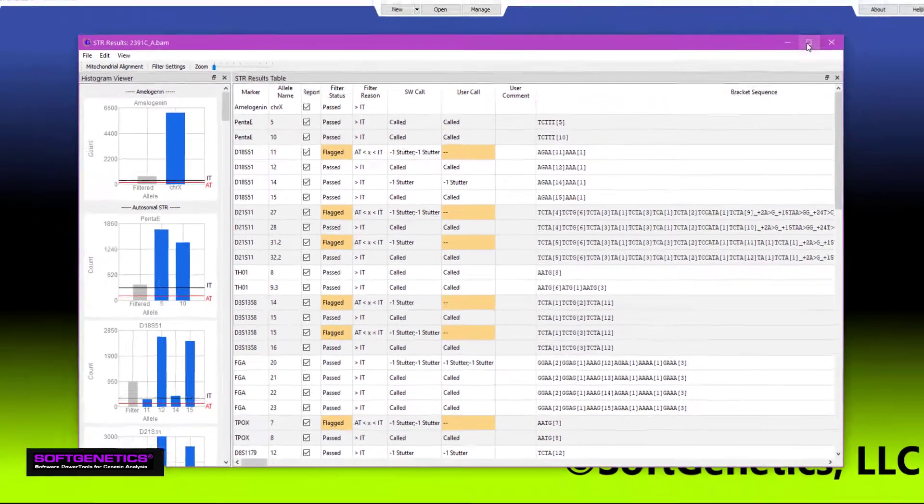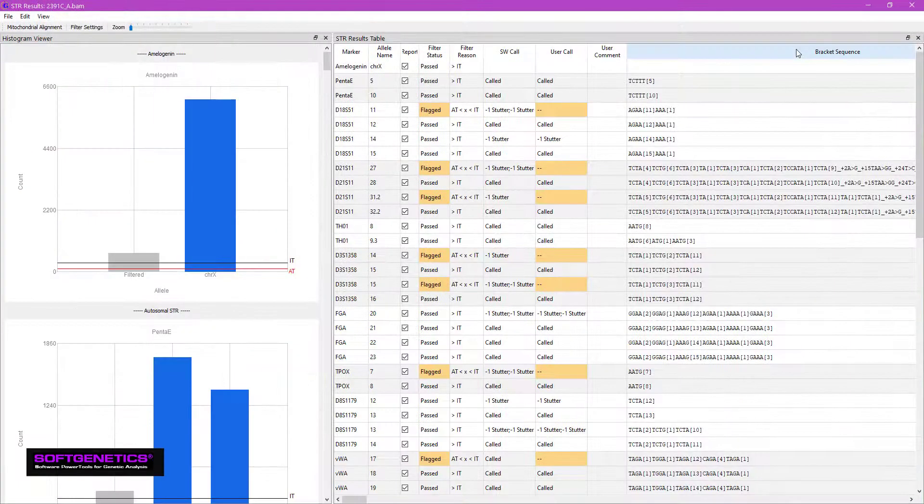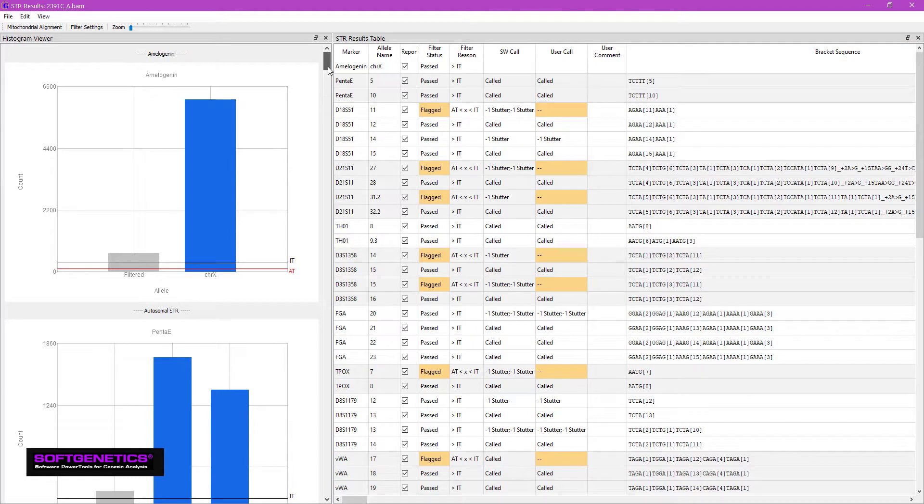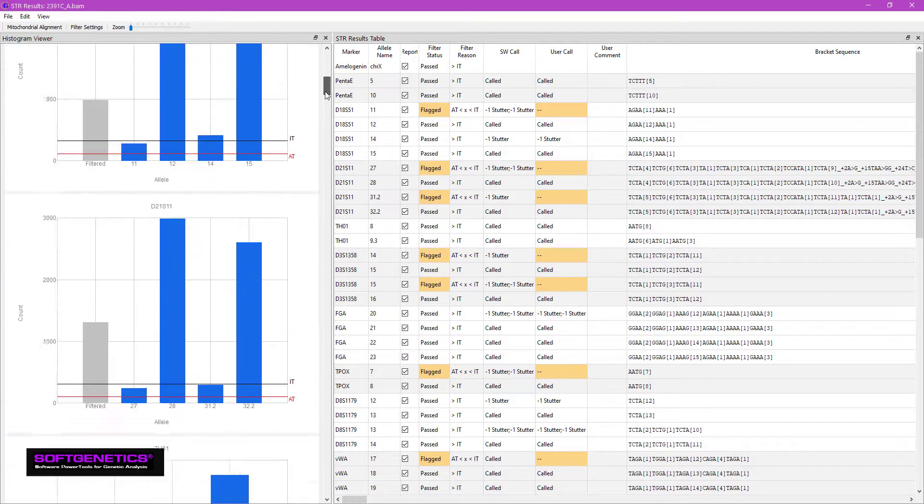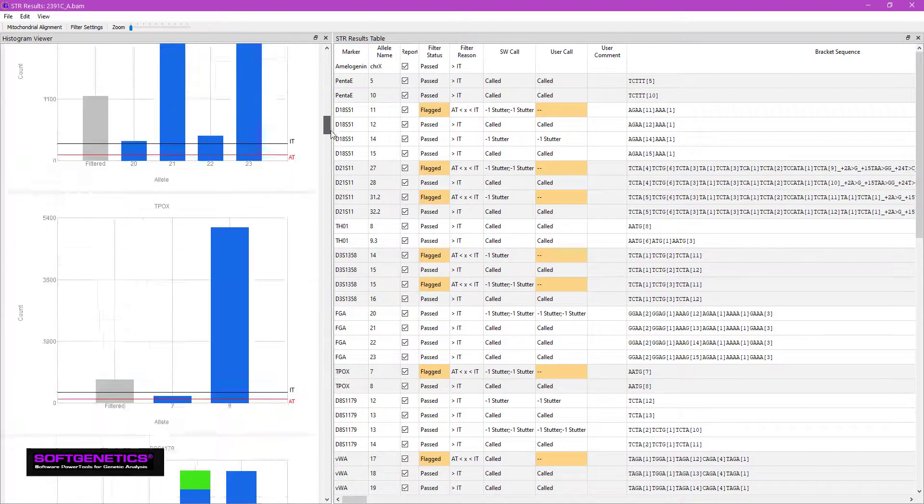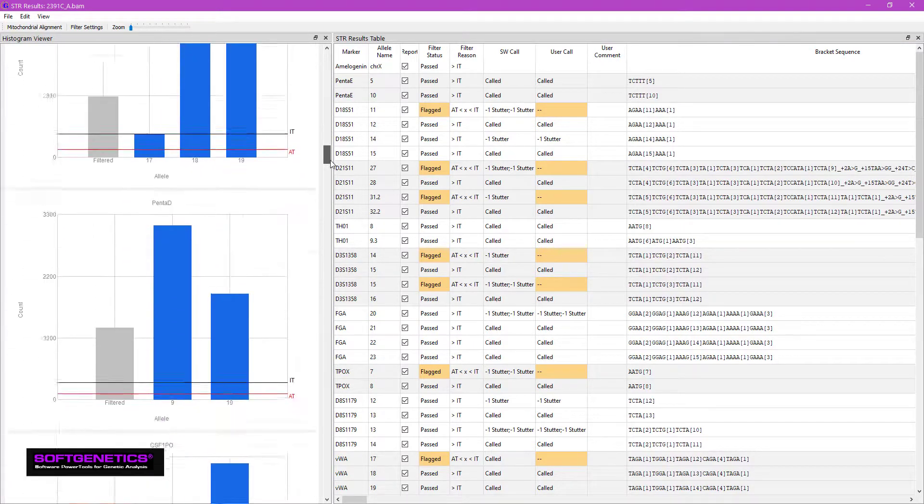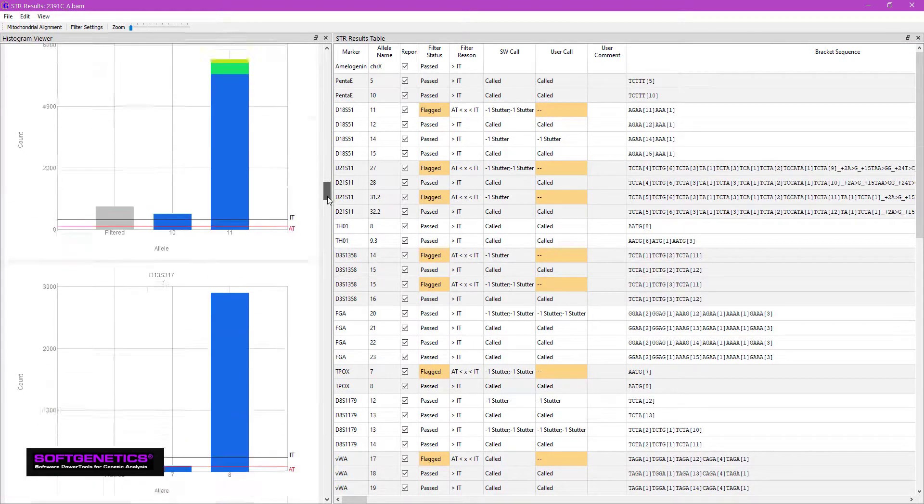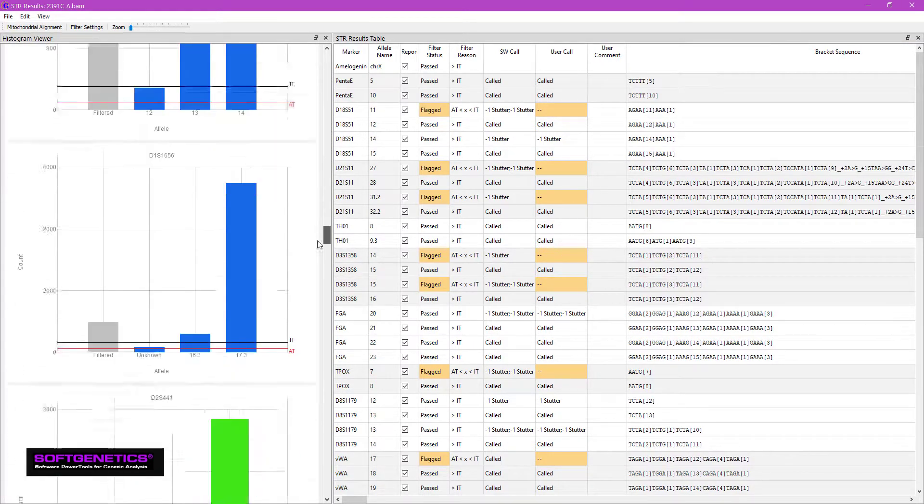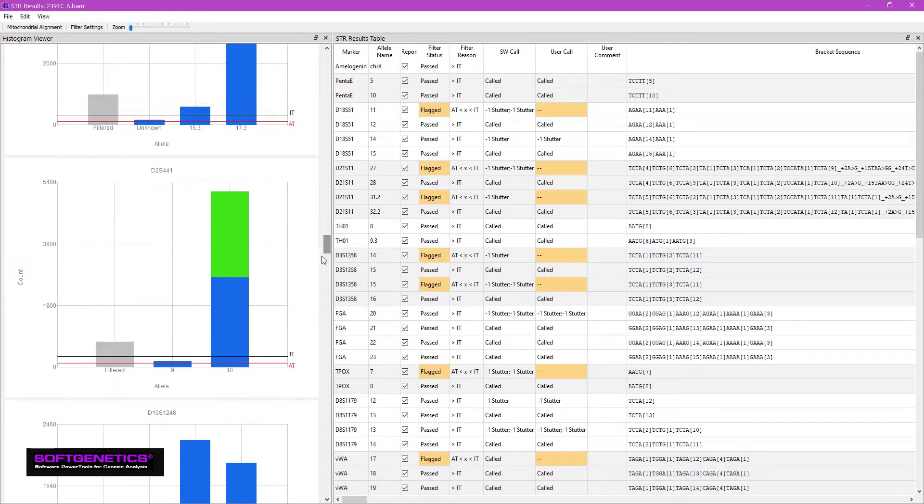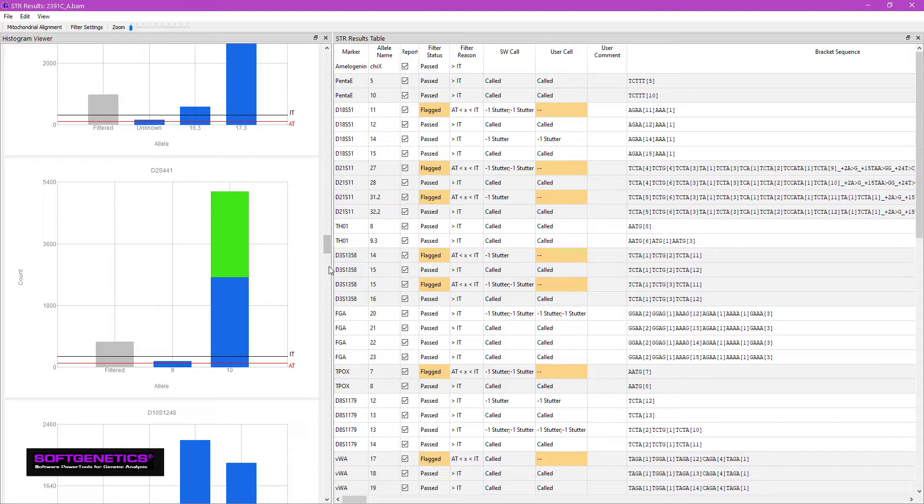This is the STR results screen. On the left is the histogram viewer, showing separate histograms for each of the STR and YSTR markers. The different colored bars indicate the presence of isoalleles, which are loci that appear homozygous in length-based measurements, like capillary electrophoresis, but are actually heterozygous when sequenced.